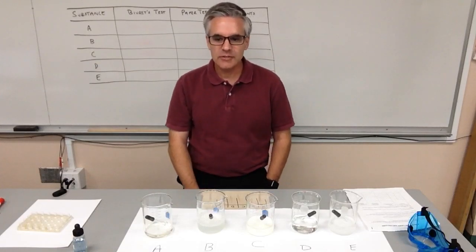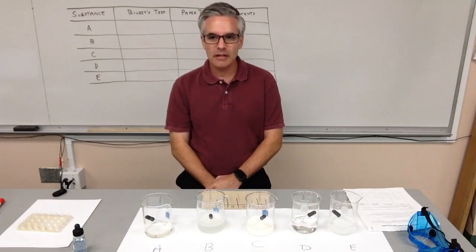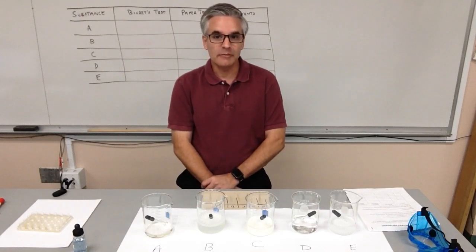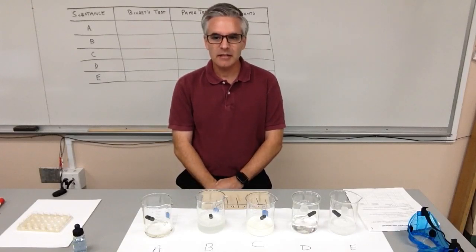And they're unknowns. And so your job would have been to use these different tests to figure out, first of all, is there a lipid in there? Is there a protein in there? Is there both, or is there neither one of them? So it's a possibility that it might not have anything, it might have both, it might have just one or the other. And so that's going to be the purpose of the lab.